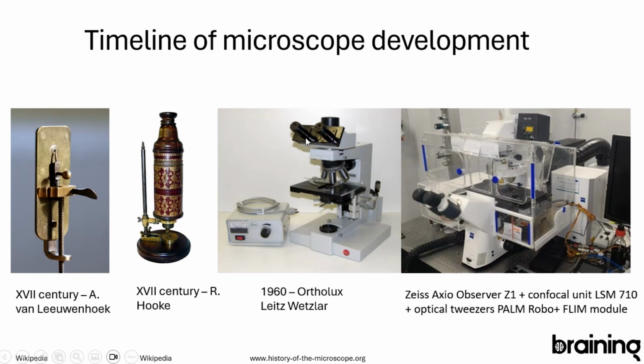This is the microscope which I was working with when I started my career in this field. Luckily, after those years and the development, we came up with this kind of microscope, which is way more than what we see here. This is actually the photo of one of our microscopes, which we have in our group.